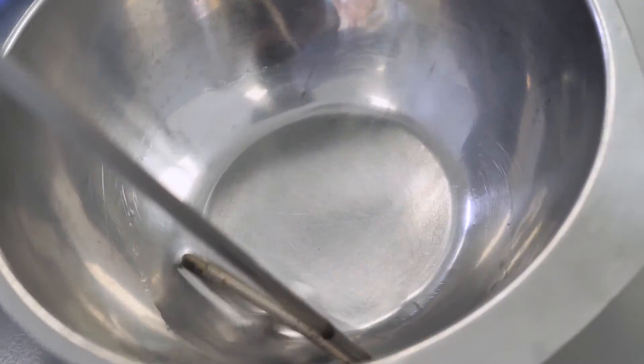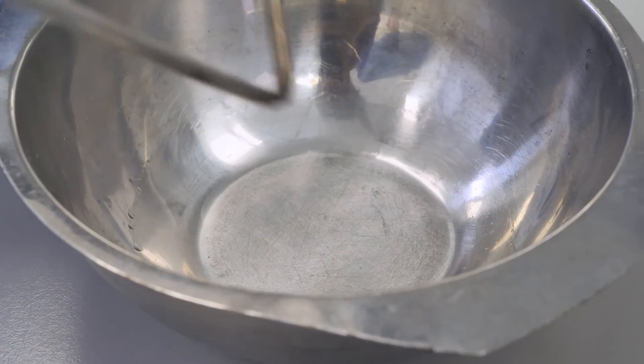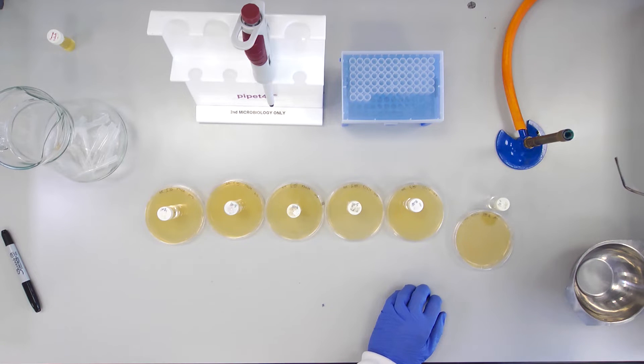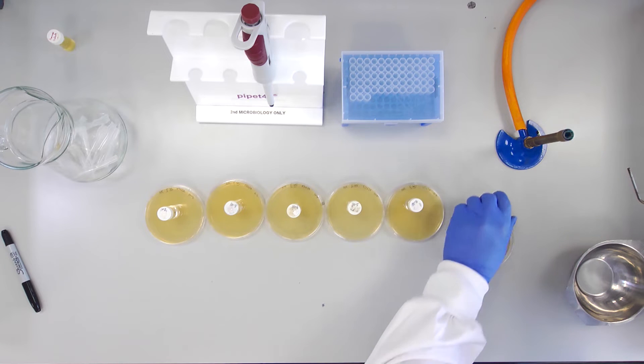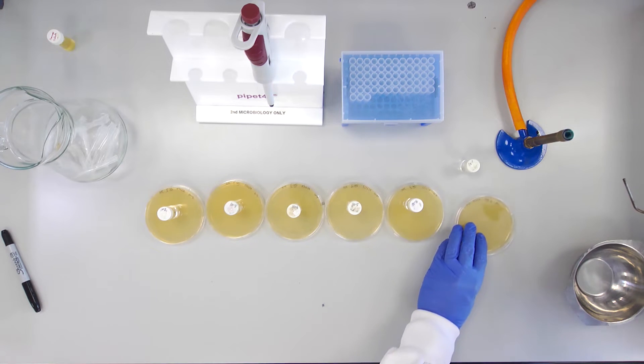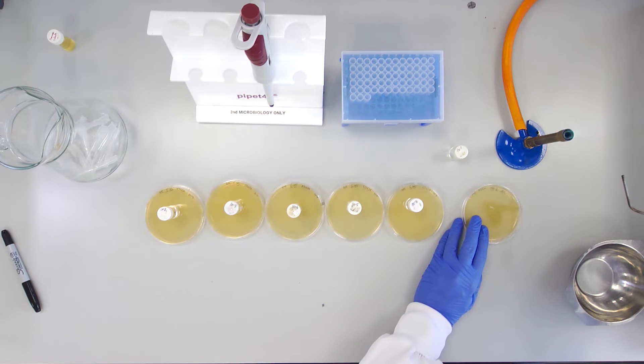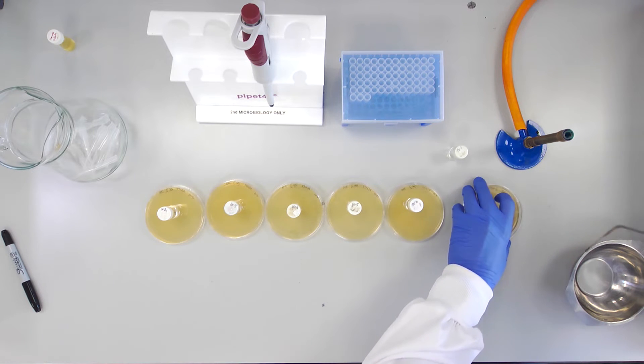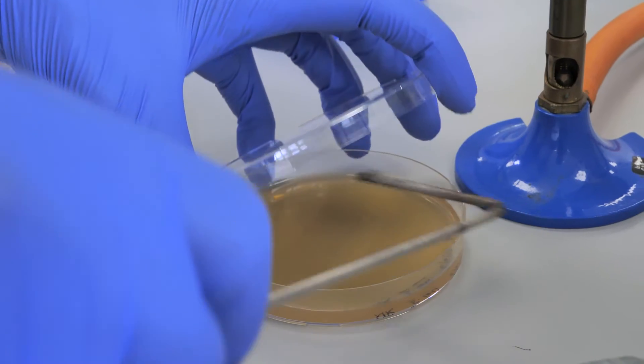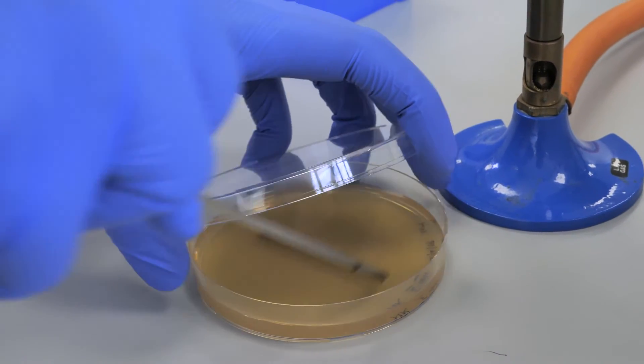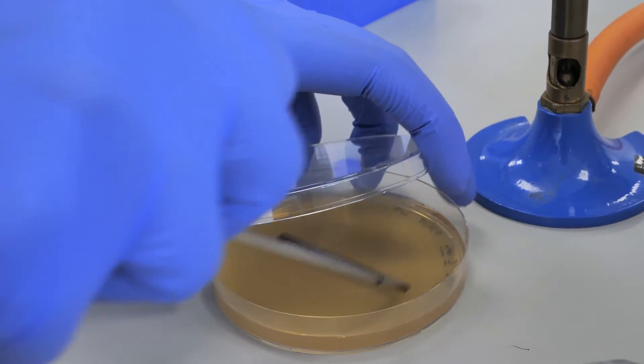Dip a steel spreader in alcohol and pass it through the flame. Remove and allow the alcohol to burn off while holding the spreader close to the flame. Allow the spreader to cool and then use it to spread the liquid culture over the entire surface of the agar as shown.